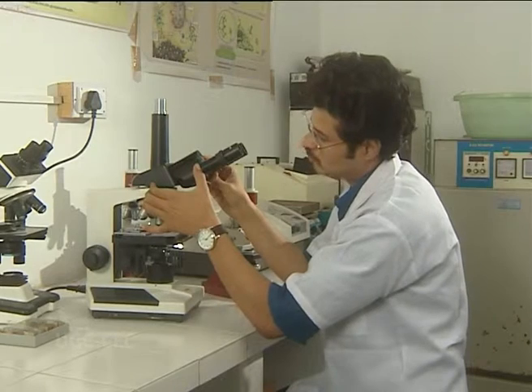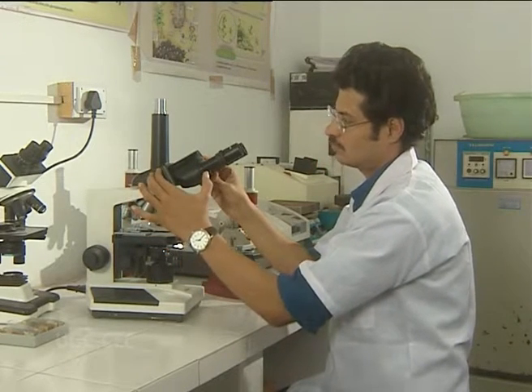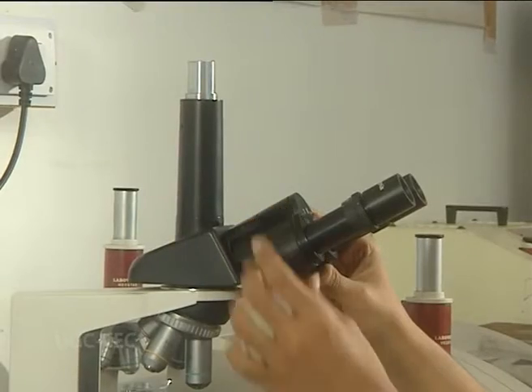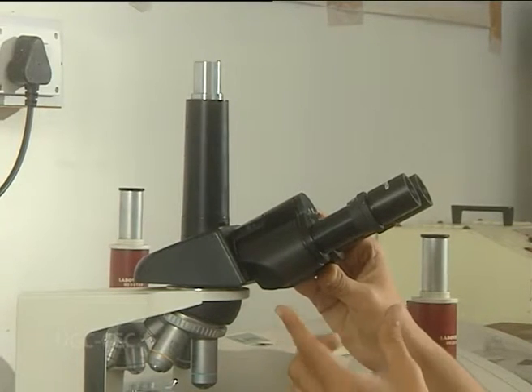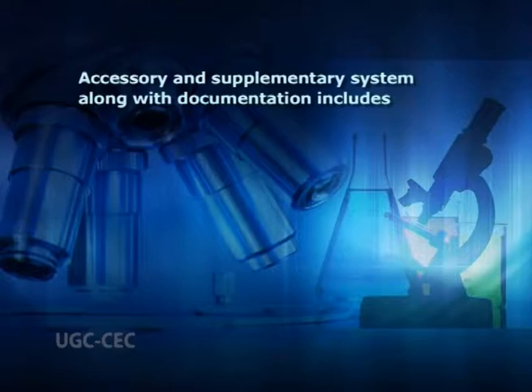In modern microscopes, it is not tubular. It contains prisms that bend the light coming up, thus providing a comfortable viewing angle. In a binocular tube, the light is also split and sent to both eyepieces.